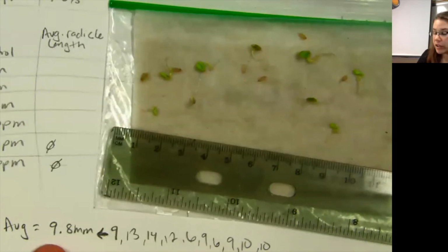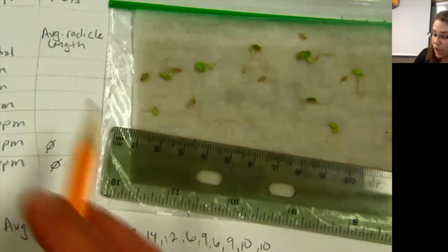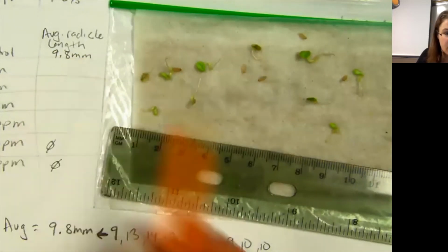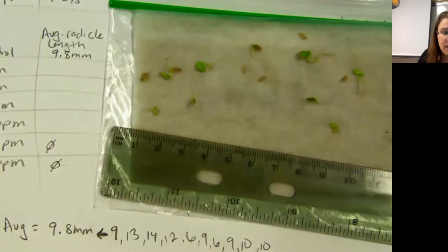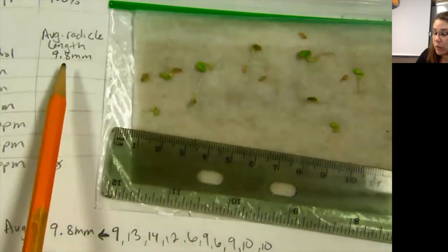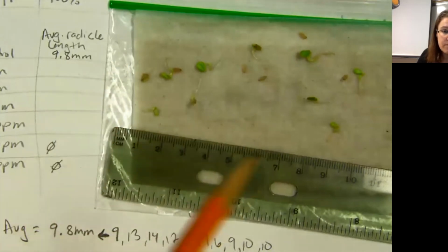Here was my water. They all germinated, so I had 10 numbers, and I got an average of 9.8 millimeters for the radicle length. You're going to do the same for all the others that germinated in 1 part per million, and then again in 10 part per million. If they didn't germinate, they're not zeros, they're just not a number.